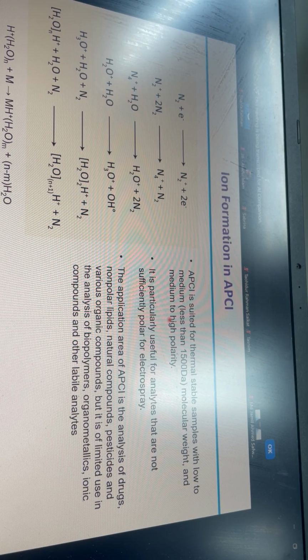So this is actually APCI, atmospheric pressure chemical ionization. This is used in pharmaceutical companies, and it can be used to identify metabolites or molecules around 1500 Dalton. So this is widely used now, but you see a water adduct because you use some water and nitrogen. So now, can we make an ionization source where we will not see any water adduct? Is it possible?